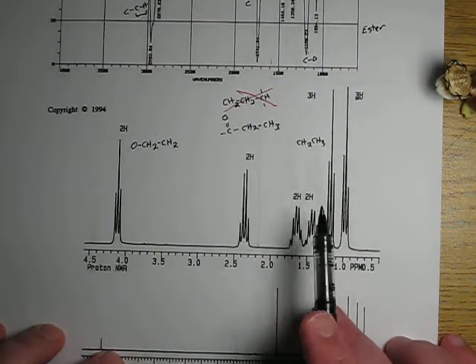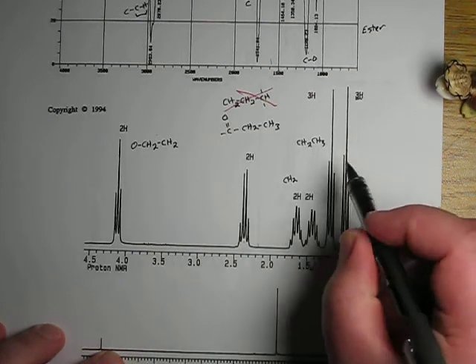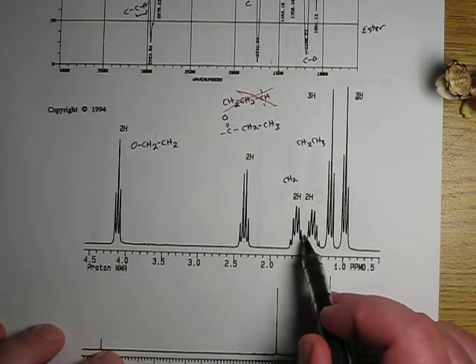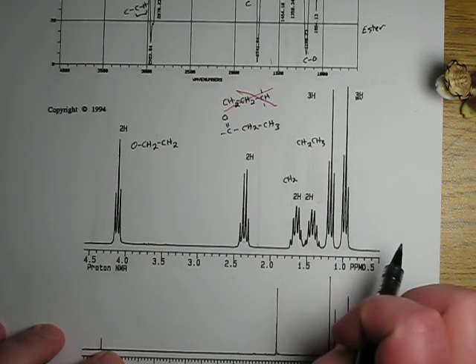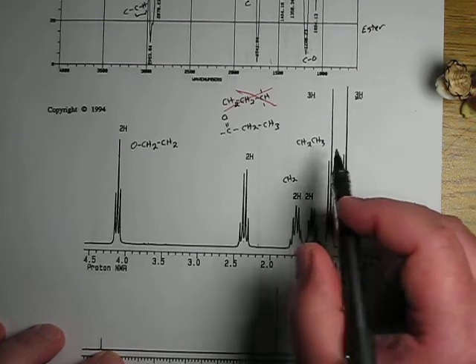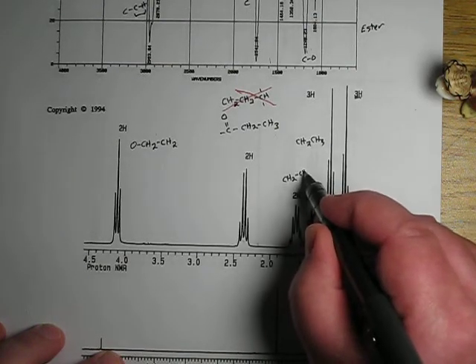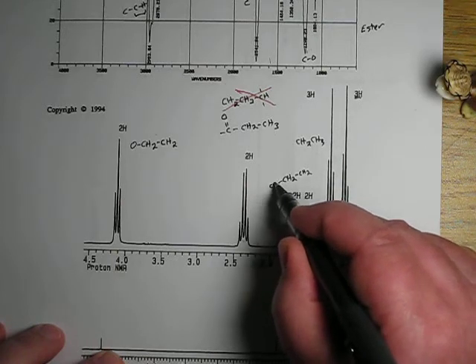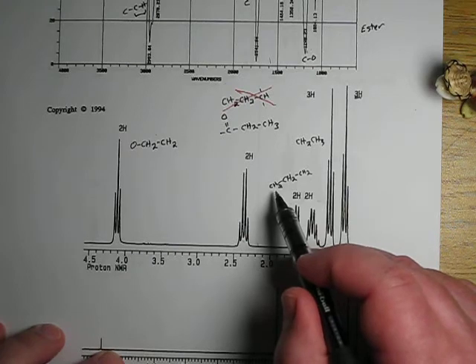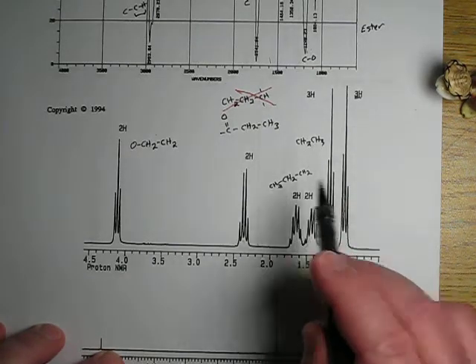Well, let's see. Integrates to 2, CH2. 1, 2, 3, 4, 5. I'm counting 5 peaks there. Are you counting 5? So that would be 4 neighbors next door. How do you get 4 neighbors next door? 2 CH2s. It could have been a CH3 and a CH, but as we already said, we cannot have a CH in here, so this is the most likely way for this peak.